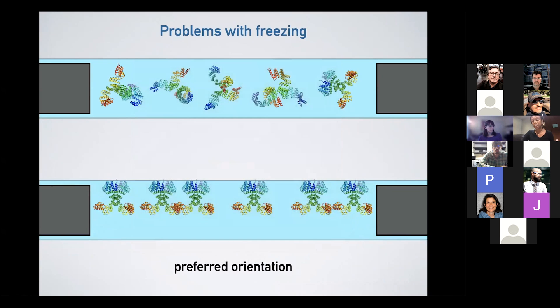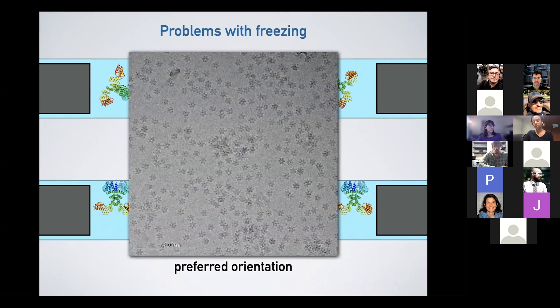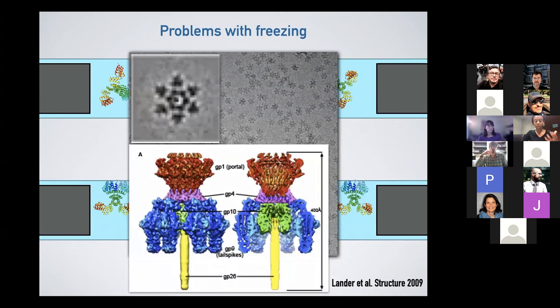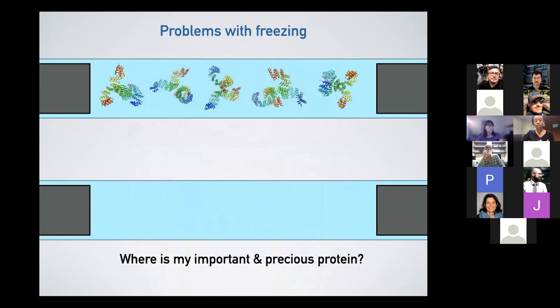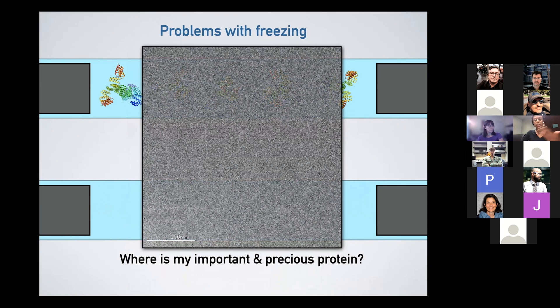You can also have preferred orientation — something that Gabe actually saw early during his PhD. I'm highlighting an example from one of his early papers in 2009, something our lab has been thinking a lot about in terms of how to overcome. You're seeing your sample essentially stick to the air-water interface, which is absolutely less than optimal, giving limited views and making it hard to process the sample. The final issue you can run into is not seeing your sample at all — it may have been entirely wicked away, leaving a completely blank image.